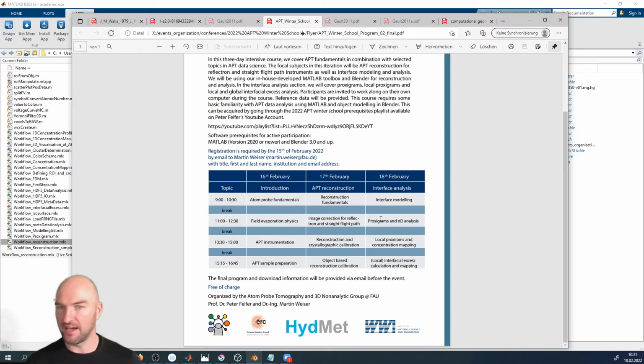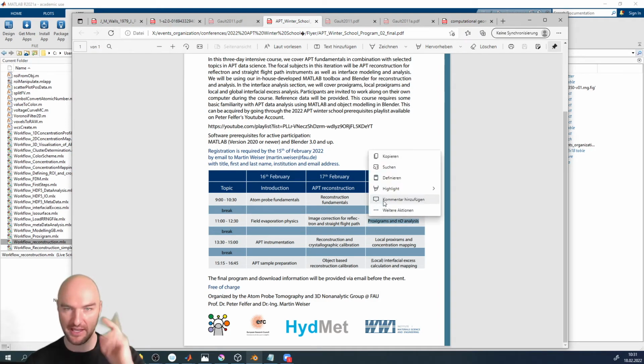So if you take the half an hour and create your own analysis object, that would be great. Otherwise, maybe we can just send out the object to you. Yeah, I'll just save the patch that I've created and send it to all of you as an OBJ, so that you can catch up if you haven't made it so far.